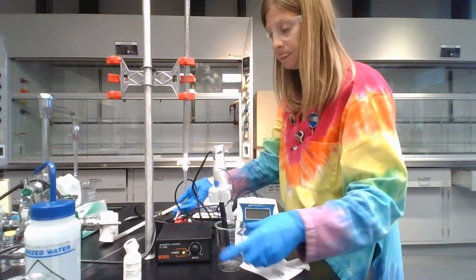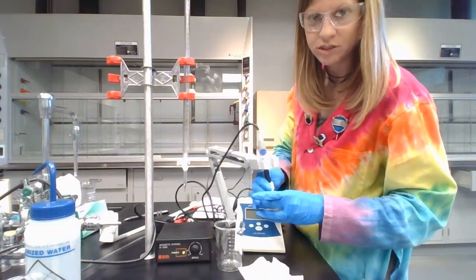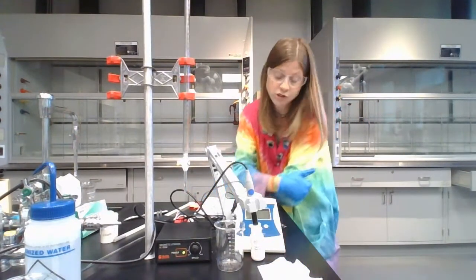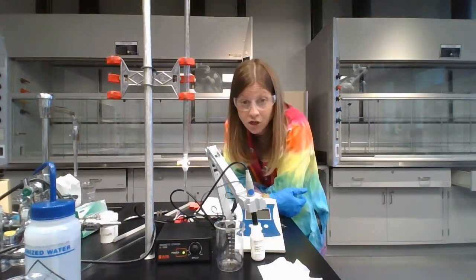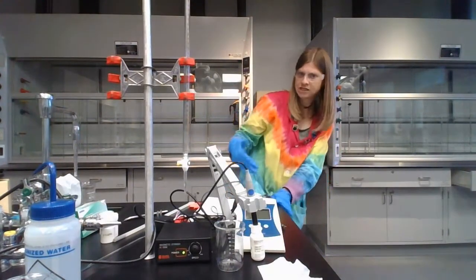So for trial 2, we're going to start the same way. Sorry, I'm just putting the pH meter back in the solution so it doesn't get dry. We're going to start the same way with the level at 0.00. You're going to write down for trial 2 milliliters of sodium hydroxide, 0.00 milliliters, and then you'll record the pH. And then you're going to start again, adding 1 milliliter, so it's 1 milliliter increments. And that's how we're going to start.